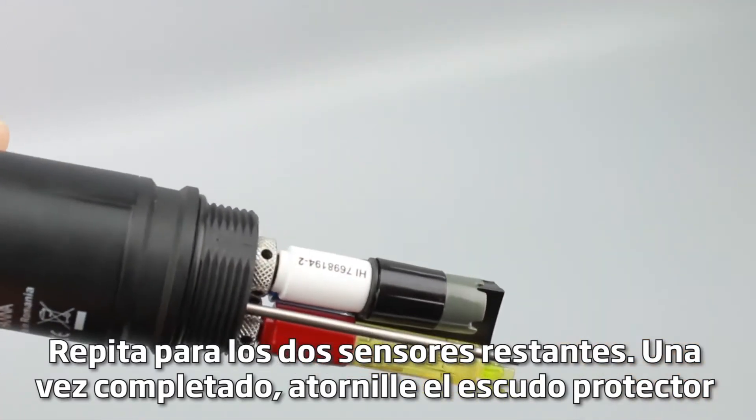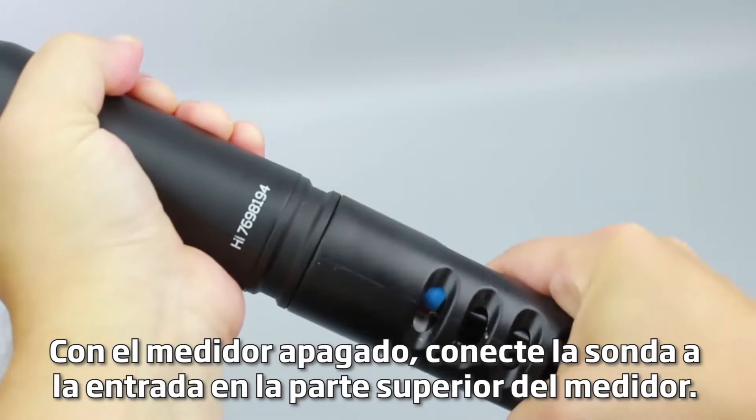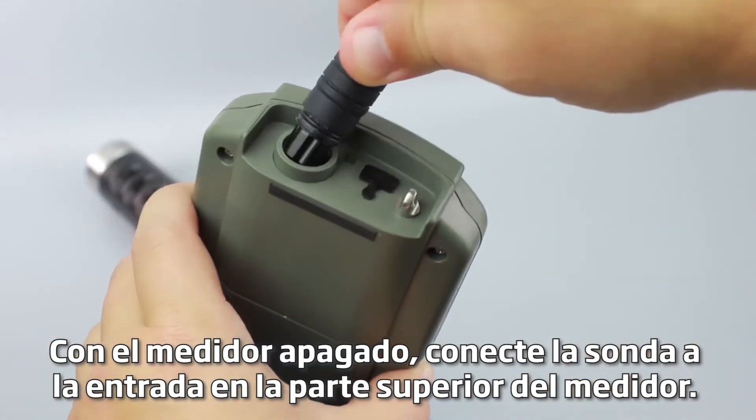Once complete, screw the protective shield onto the probe body. This will help protect the sensors. With the meter off, connect the probe to the input on the top of the meter.